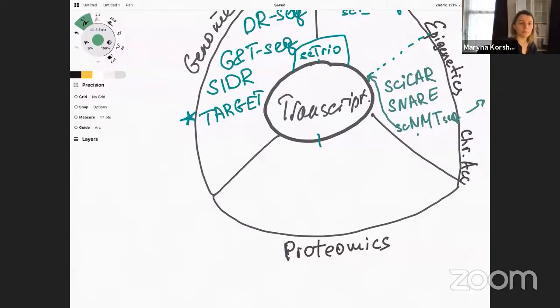So actually the idea is to first of all treat your sample with antibodies and do this antibody matching with their target, with other proteins that you are interested in, and by correlating this protein to antibody and the barcode which the antibody handles, you will be able to prepare the sequencing library, and then in your sequencing data set, look at these protein barcodes, which correspond to antibody and proteins by itself.